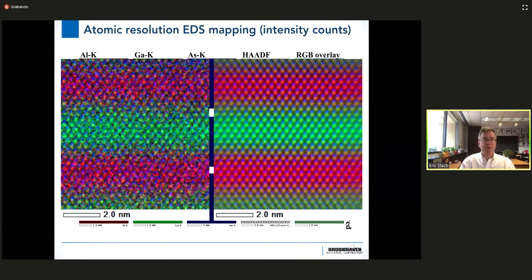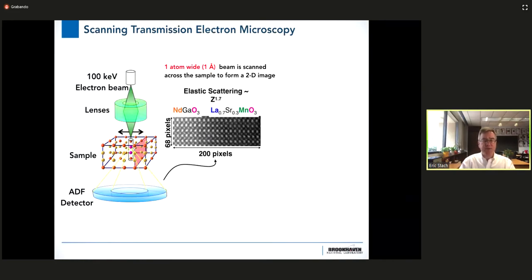In this case, we're going to do what's called electron energy loss spectroscopy. As I said, if we have our incident electron come in and knock one of these electrons off of the shell, creating the characteristic X-rays as a result of that transmission, the incident electron loses an energy, and that energy loss is transmitted down through the column. What's interesting is the geometry of our setup is such that we have capture of the high angle scatter to form our image, but the incident electrons that undergo these inelastic scattering events are generally very forward scattered. So they're not collected by the annular dark field detector.